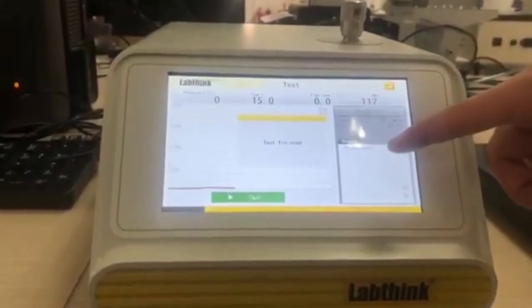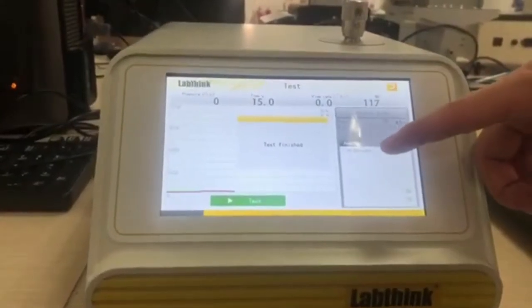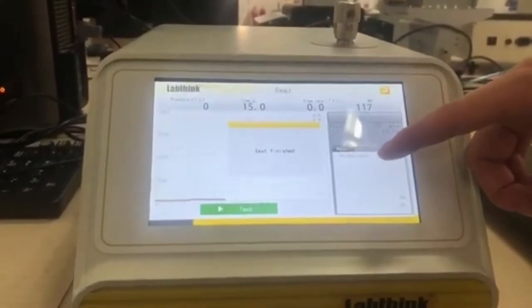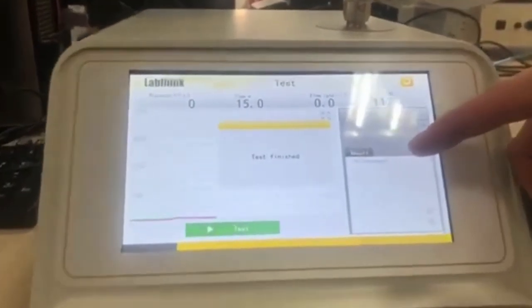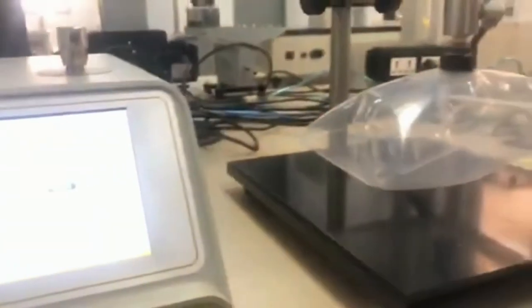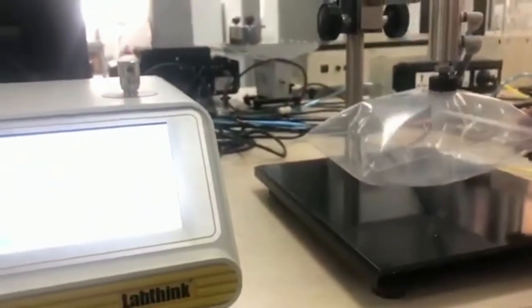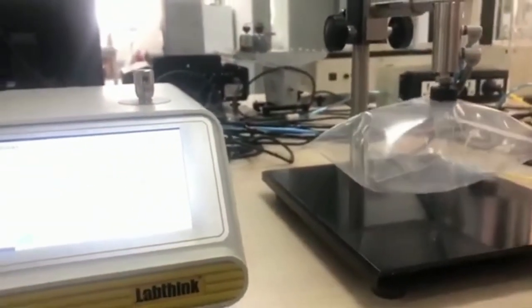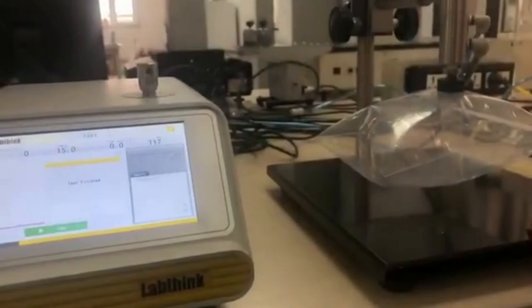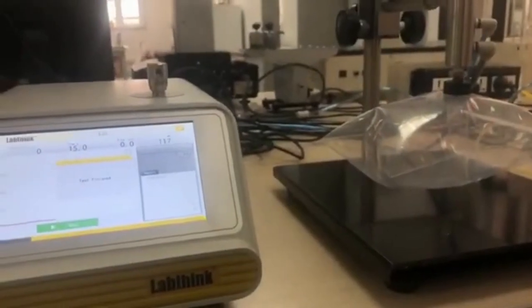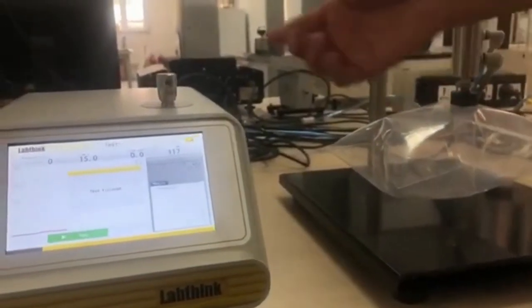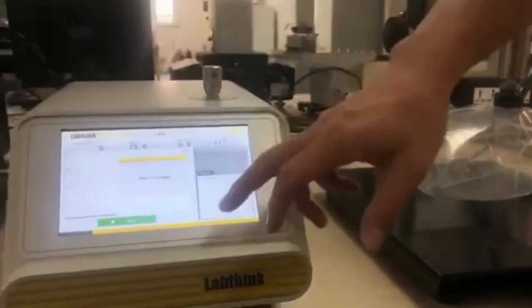And the sample is unaccepted. That means the pouch has a pressure decay over 10 millibar. Okay, that's all.